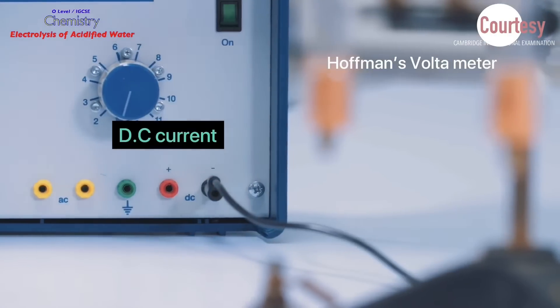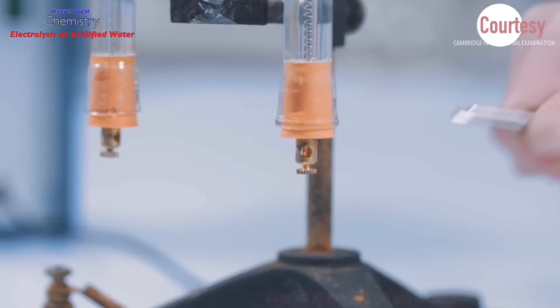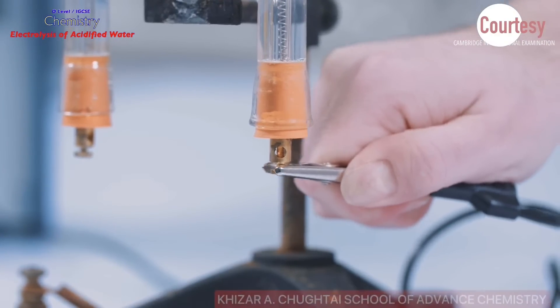Black cable is then connected to the negative terminal of the DC power supply and then one of the platinum electrodes. This becomes the cathode.